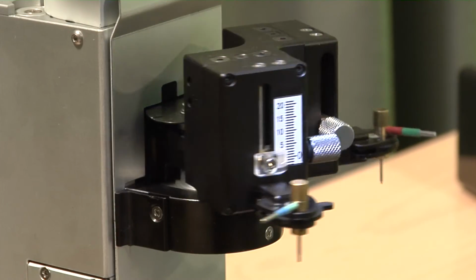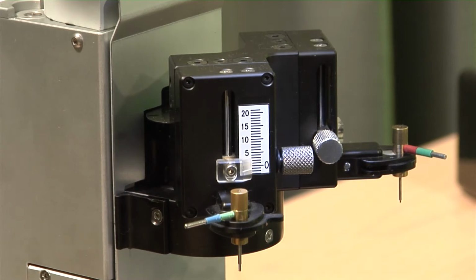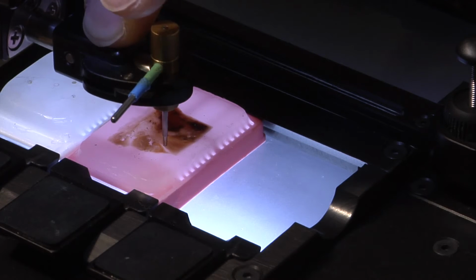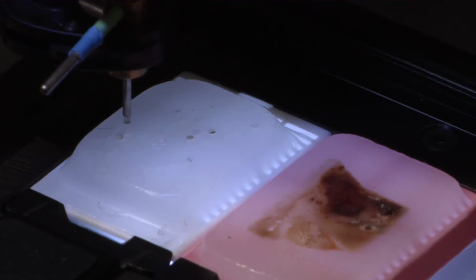On that unit we have also some head for needle mounting. You have, of course, 2 needles, recipient needles and donor needles, for making holes in the paraffin, taking the tissue and giving back tissue to recipient blocks.